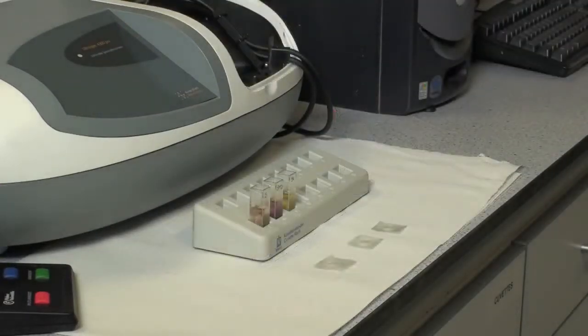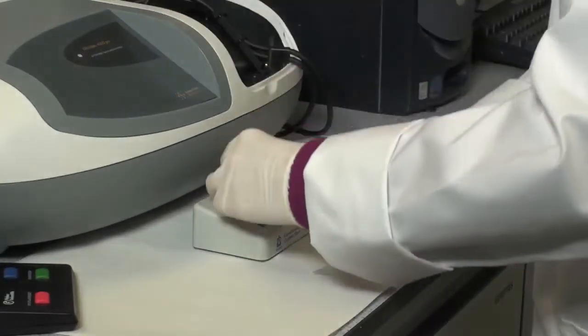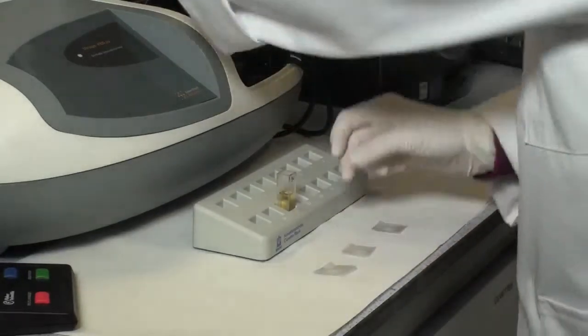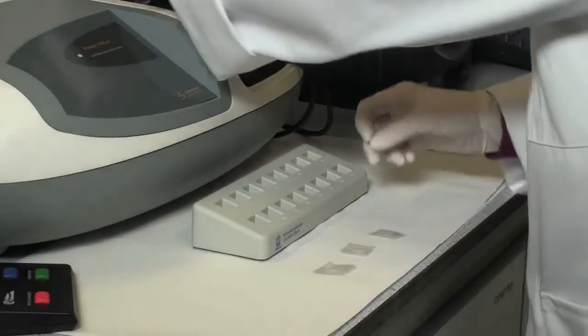After reading absorbances A2 for each solution, mix each solution, then read absorbances A3 for each of the solutions, exactly 3 minutes after reading A2. This third reading is required because the free sulphite test generates a creep reaction, and this is accounted for in the calculation of results.